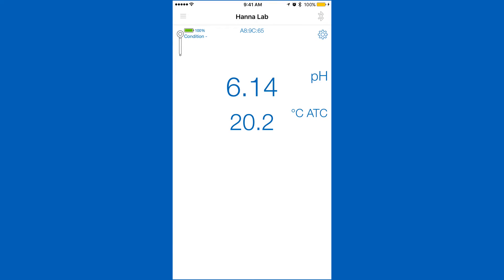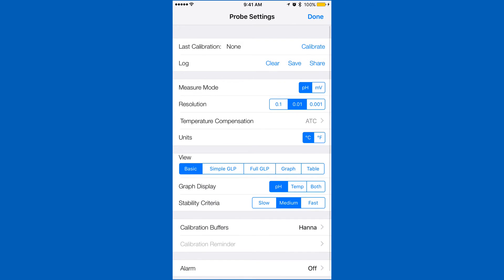Calibration is an important part of keeping your Halo operating at its best. We recommend calibrating before each use. To calibrate your Halo pH meter, go into the settings menu. Tap calibrate and you will be taken to the calibration screen.